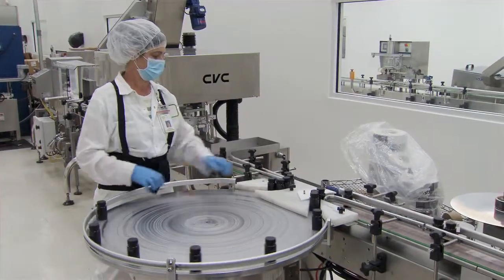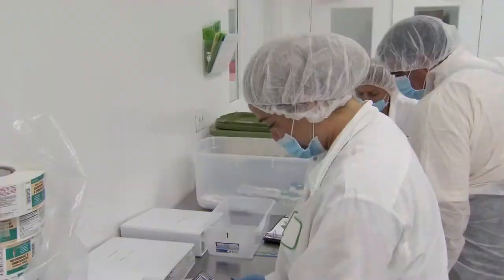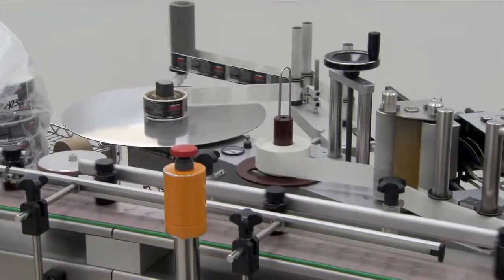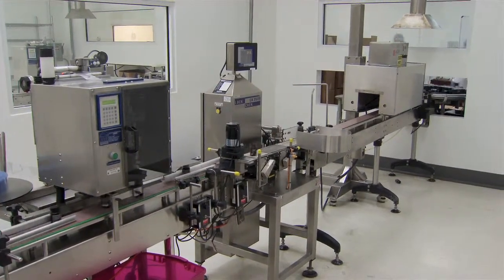Just like in manufacturing, the operators do their own quality control checks throughout the run. But in addition to that, there's also an independent quality control group that comes in and throughout the run, they sample product from the line. They open it, make sure it's sealed properly, make sure it's got the correct count, make sure it's got the right label, make sure the lot number is accurate, make sure that it is a perfect finished good, exactly the way it was designed to be when it gets to the end of that line.